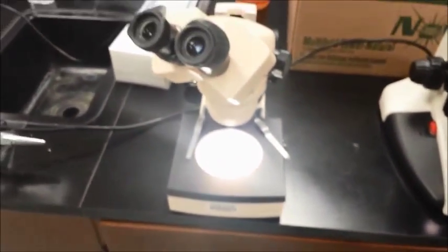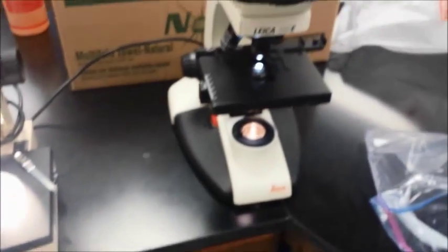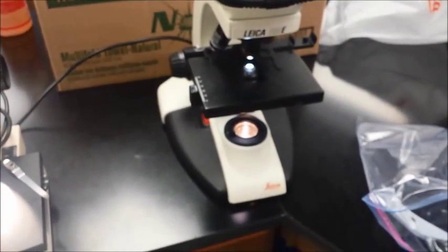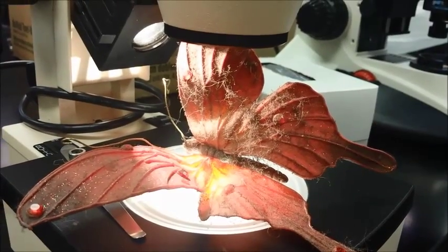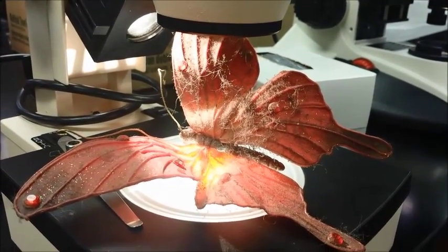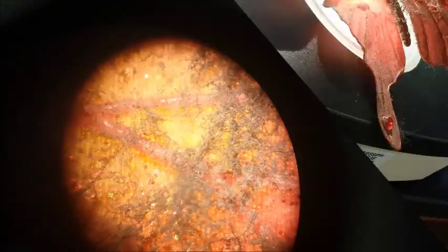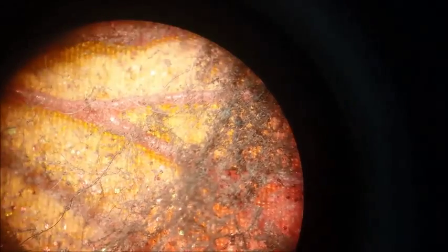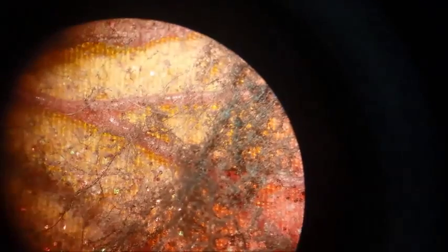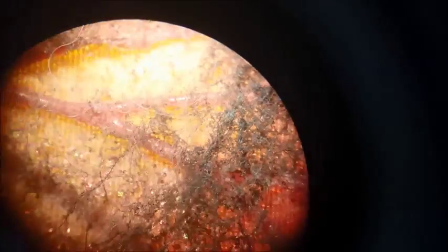So we might take it and put it under a dissecting scope first and just take a superficial look, and then we can make some slides and put it under this regular microscope second. When you look at it that way, it's pretty nasty looking. So we'll see what it looks like under the dissecting scope. Knowing that there are pet hair fibers in the house makes me think that these are pet hair fibers covered by dust so far. That's what I'm thinking. We'll see.